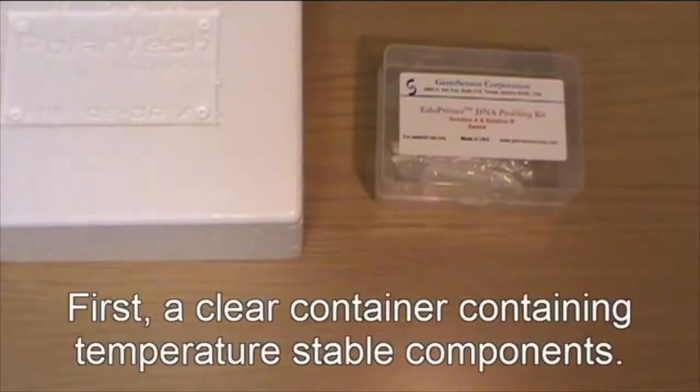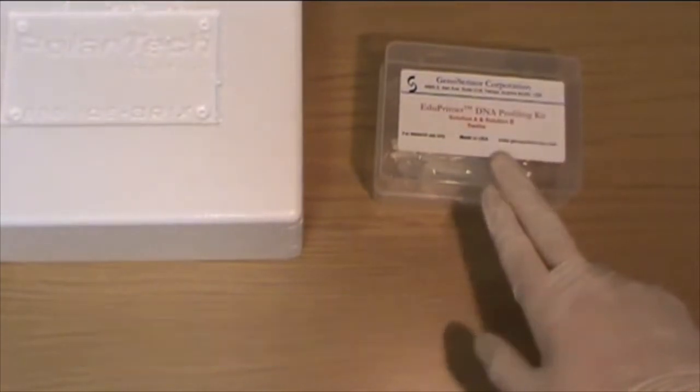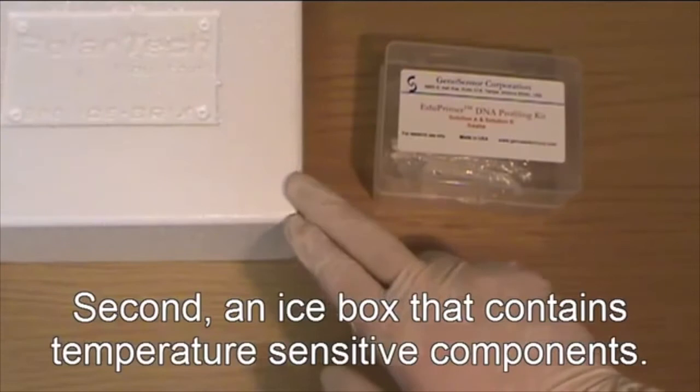First, a clear container containing temperature-stable components. Second, an icebox that contains temperature-sensitive components.